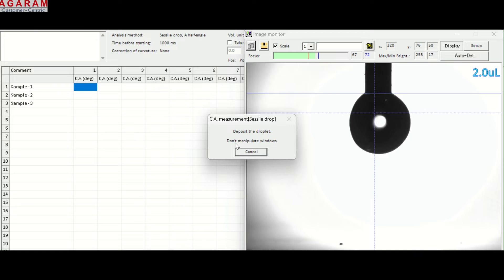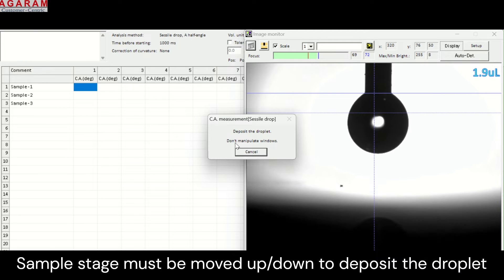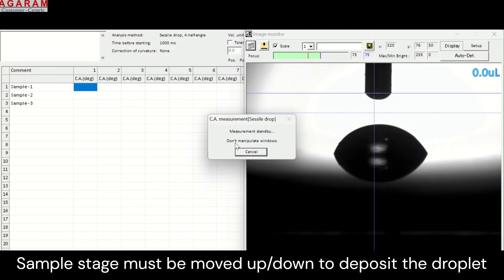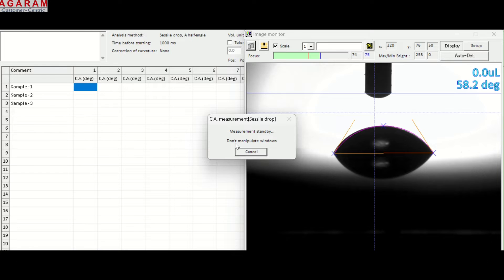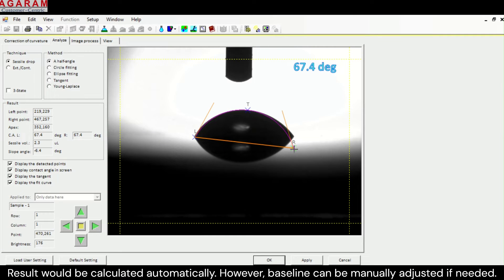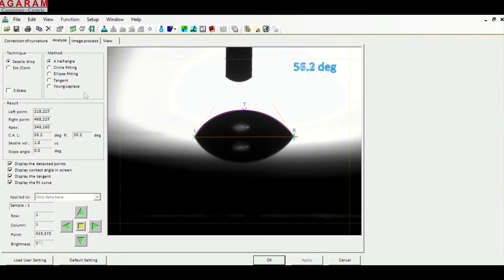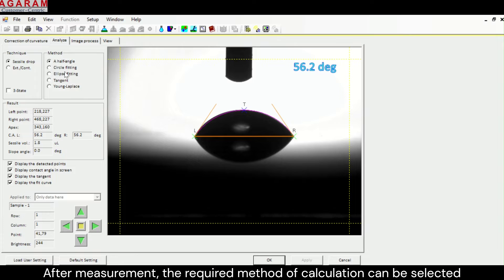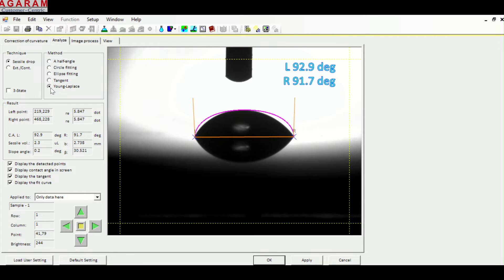Our software comes with advanced edge-detection technology that can measure even the superhydrophilic results. However, you also have an option to manually select the edges and baseline. You can choose your preferred calculation method after completion of the measurement. Various parameters and methods can be analyzed from a single measurement.